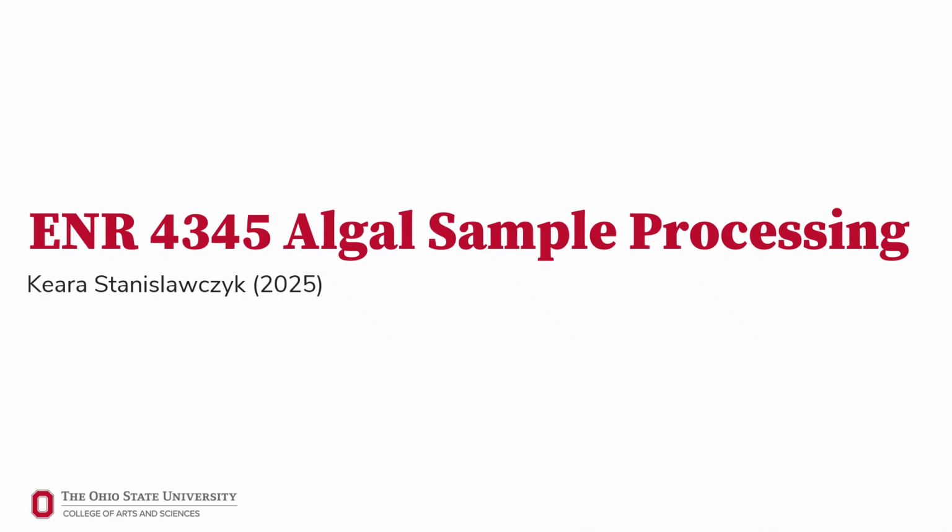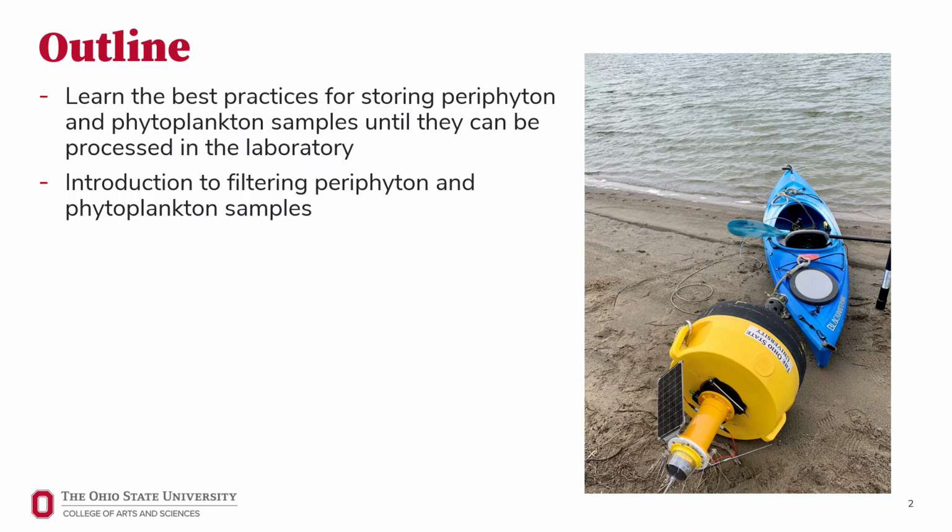This is Algal Sample Processing, a lecture for ENR4345, Methods in Aquatic Ecology course at The Ohio State University. In this lecture, you will learn the best practices for holding periphyton and phytoplankton samples in the field until you return to the lab. Finally, I will quickly go over the filtering techniques that we will be using in the next lab period.